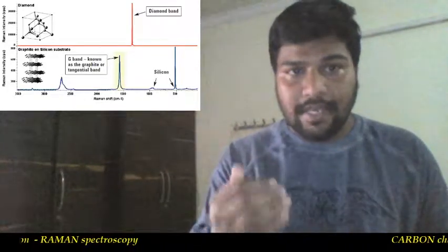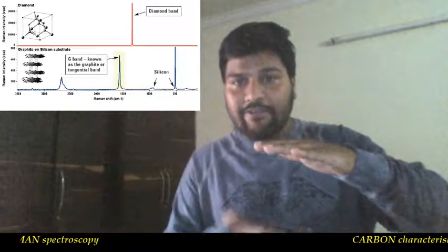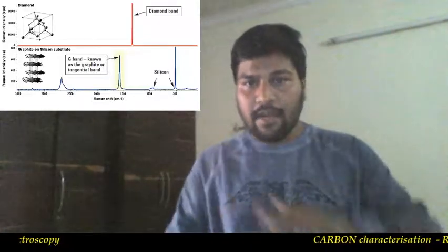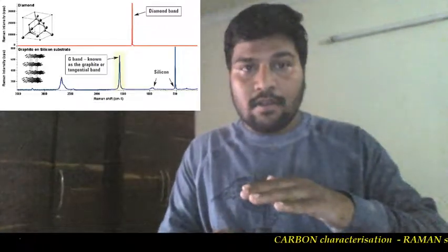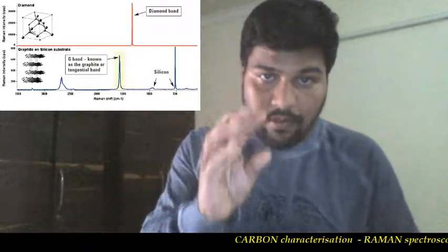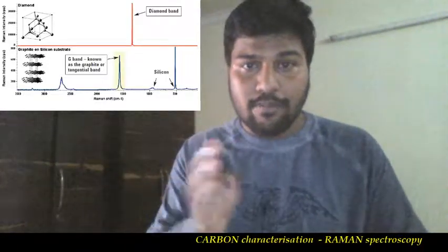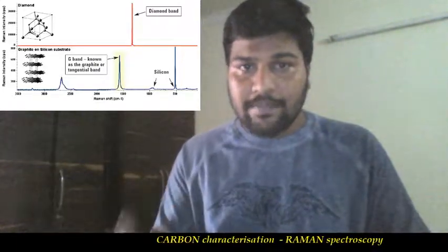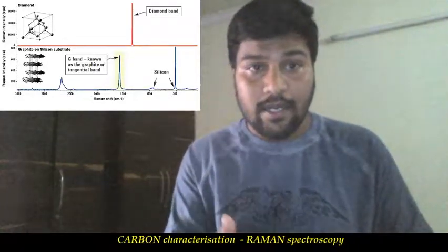But in the second case, graphene or graphite, you have a stack of two-dimensional layers of carbon. So basically it's a three-dimensional view, with stacks of 2D arrays or layers of graphene. In the second case, we can identify the material based on the bond strength. This scenario is related to bond strength, where diamond is sp3 bonded, and graphite is sp2 bonded.